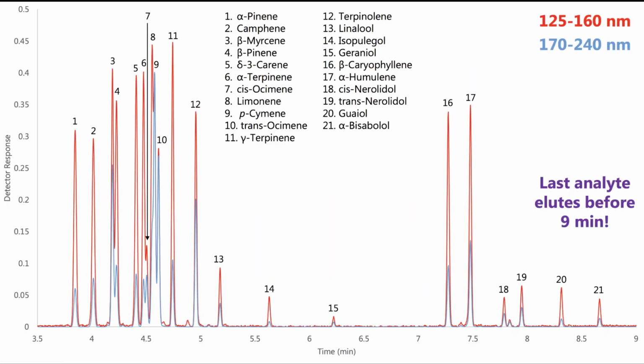This next figure shows a chromatogram of our terpene standard mix. Traditional runtimes can be upward of 30 minutes, but with an increased flow rate and oven ramp, we are able to compress the chromatography to a sub-9 minute runtime. Compressing the chromatography to this degree causes multiple co-elutions, but with our software, we can deconvolve these co-eluting peaks, and we'll take a closer look in the next figure.